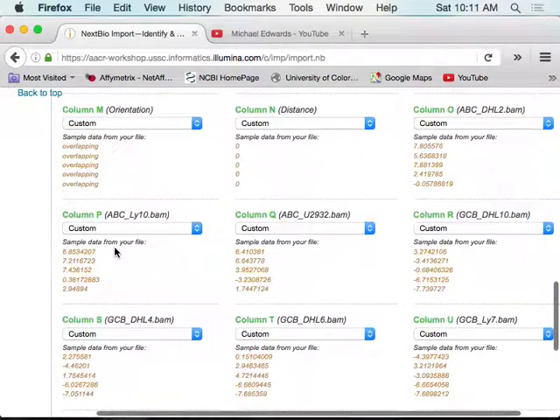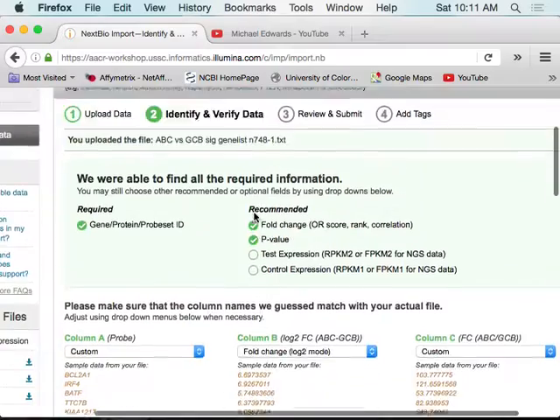So basically, when I'm putting gene lists into most bioinformatics software programs like this, what it wants is a unique identifier that it has a record of. Then it wants fold change, and then it wants a p-value. Those are the only 3 pieces of information you need. And you don't have to use genes, right? We could use proteins. We can use metabolic states. We can use anything.